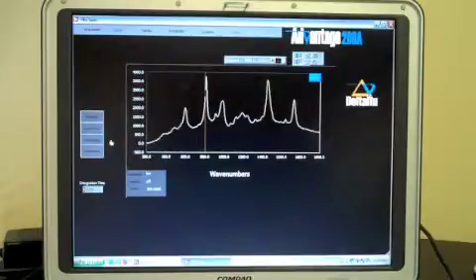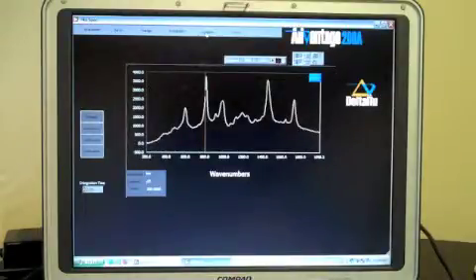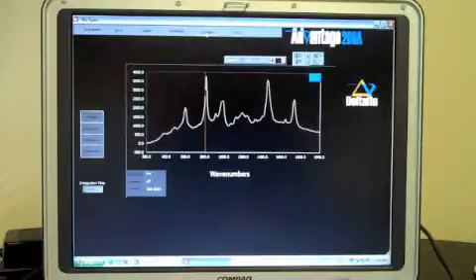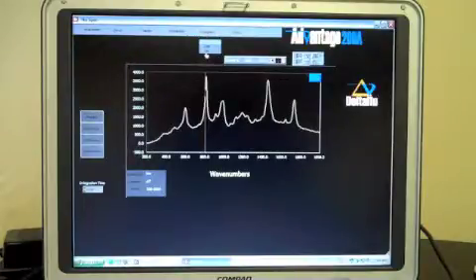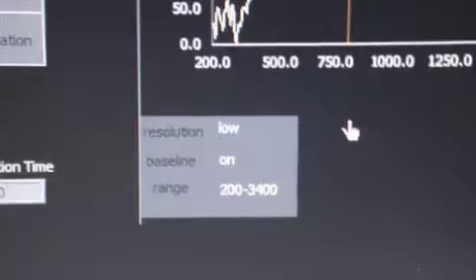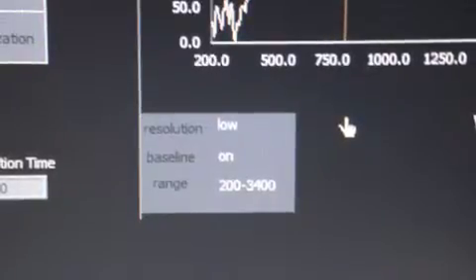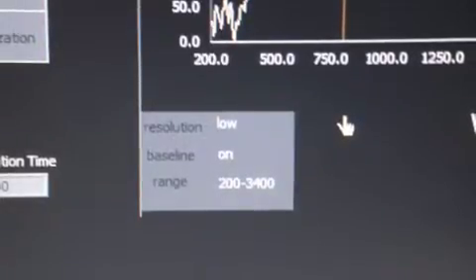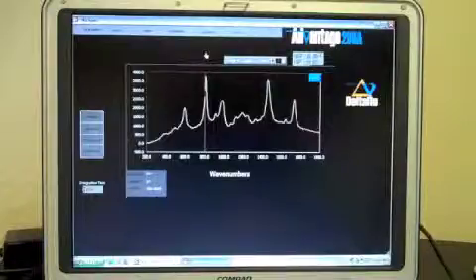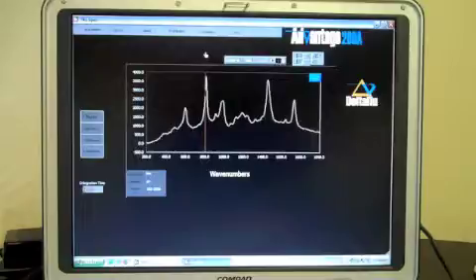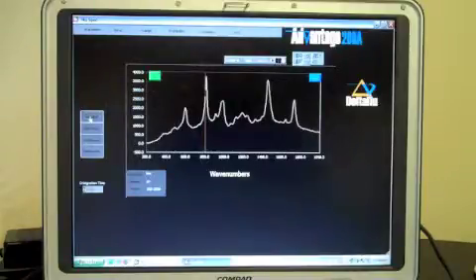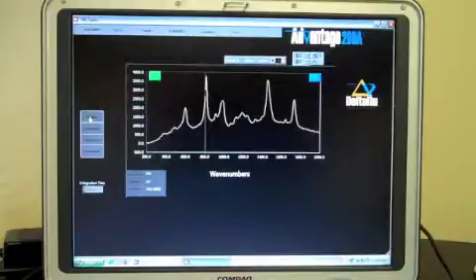Frequently, background fluorescence produces a large signal that can swamp out the weak Raman signal. We can subtract out this background automatically by choosing baseline from the menu along the top of the screen. You should see the status box change from off to on for the baseline below the spectrum. Press acquire to collect a new spectrum. The baseline correction should flatten out the background.